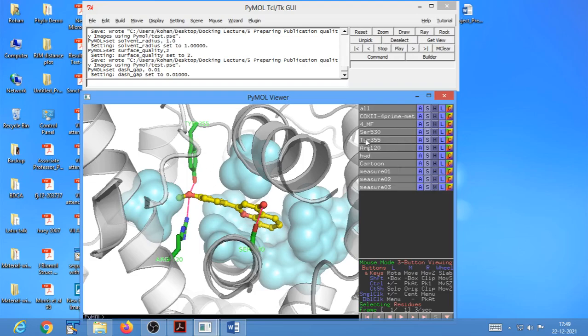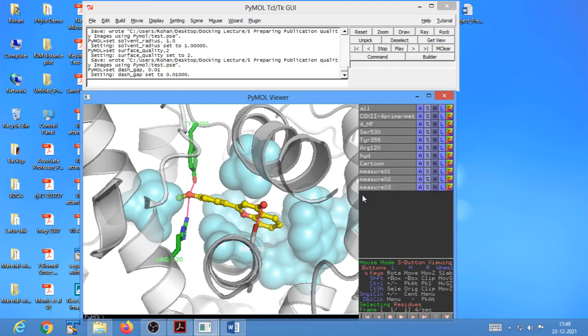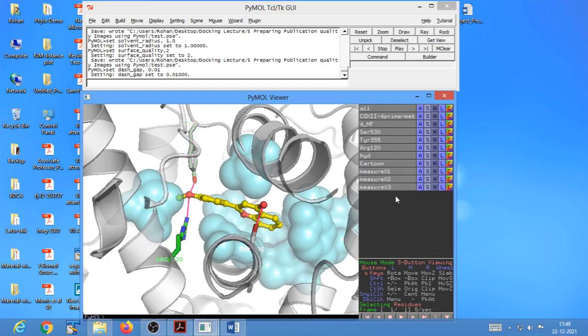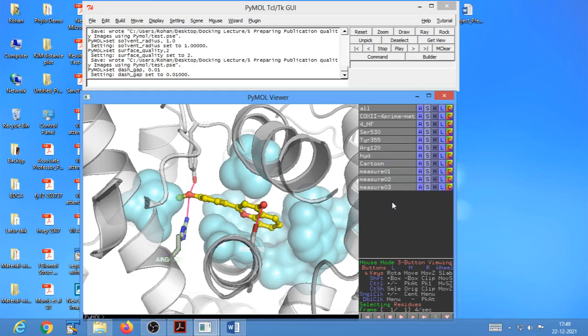After doing this, we can also change the color to white, right? It would look good. It is all up to you.